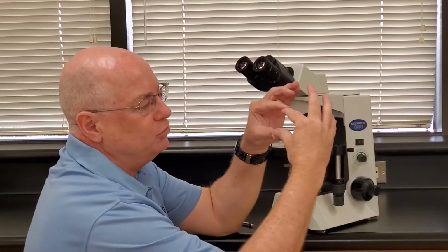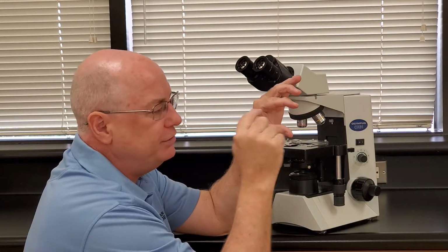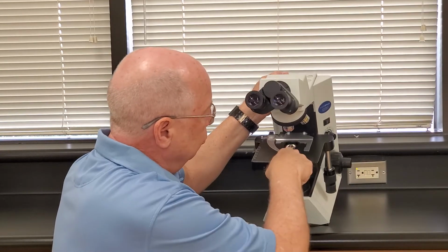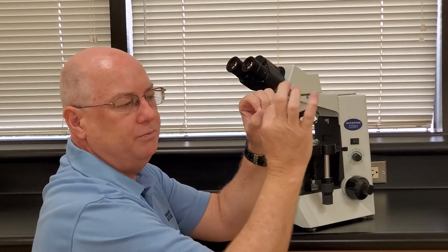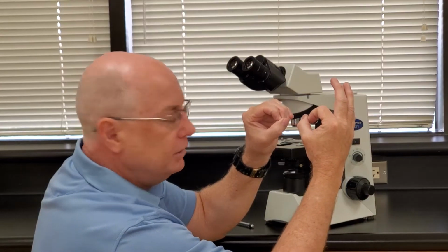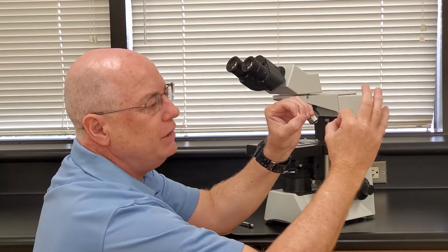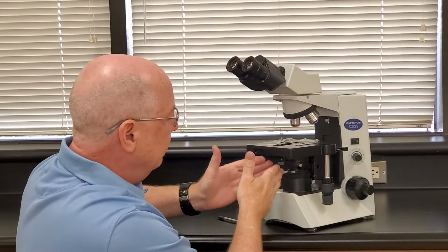Now, our slides will have a little object to see and a little cover slip that's either round or square. Whatever's underneath that cover slip is what you want to see. When I mount my slide, if this condenser lens, which is lined up with all of these structures, is not sitting where that little patch of glass is, the cover slip on your slide, if they're not lined up, you can turn the knob for days and you'll never see what you're supposed to see. You need the cover slip of your slide sitting right over that condenser lens in the beam of light coming out of it.